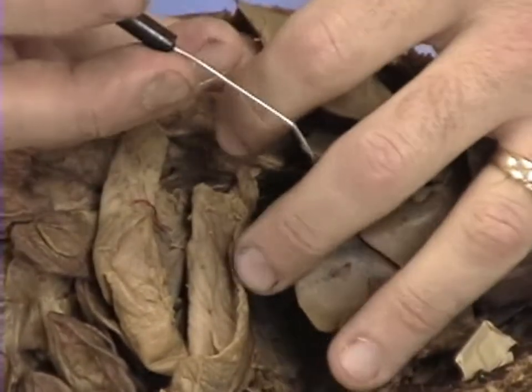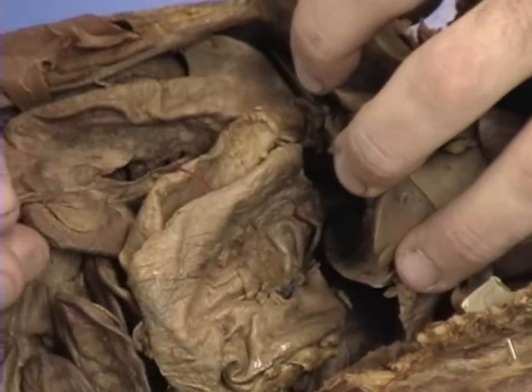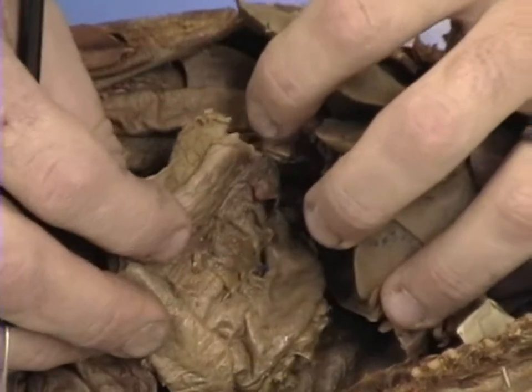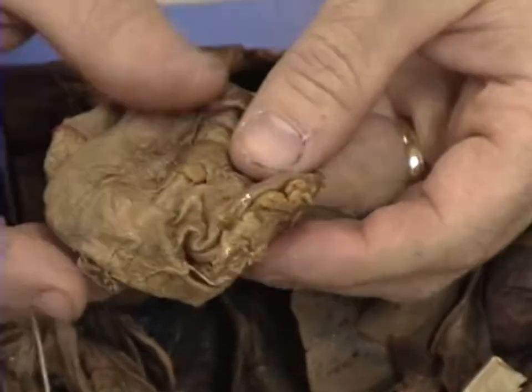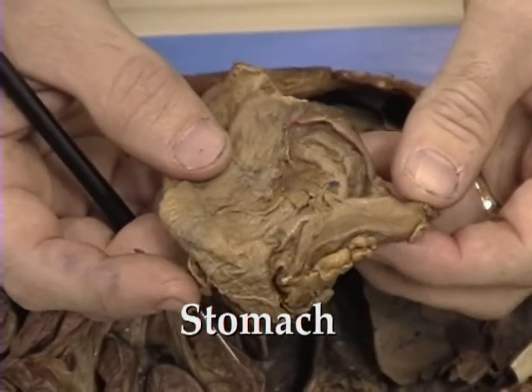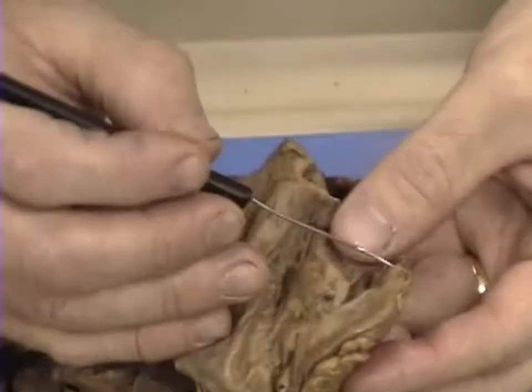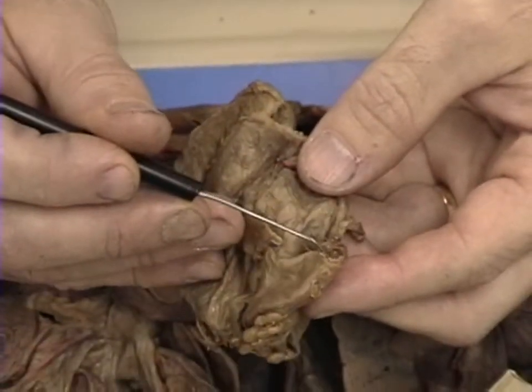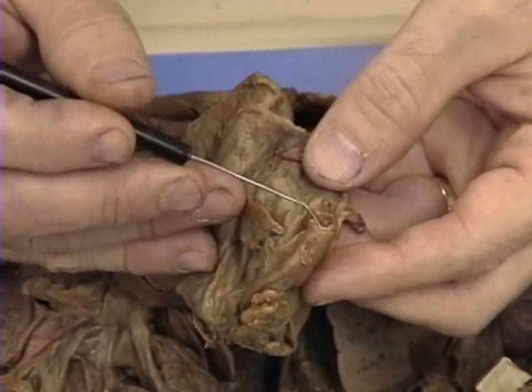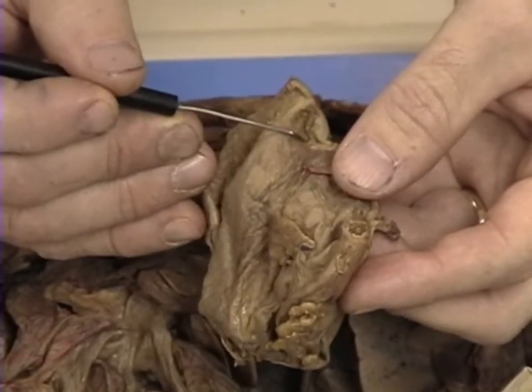Next, we'll push the liver aside and we'll examine the stomach of the cat. The stomach has already been dissected, so I'll pull out the stomach just to show some of the features. Here's the stomach, which is a large sac on the cat. We have two portions of the stomach. First of all, we have an opening here that will attach to the duodenum. We also have an opening here, the cardiac opening, and this will attach to the esophagus.